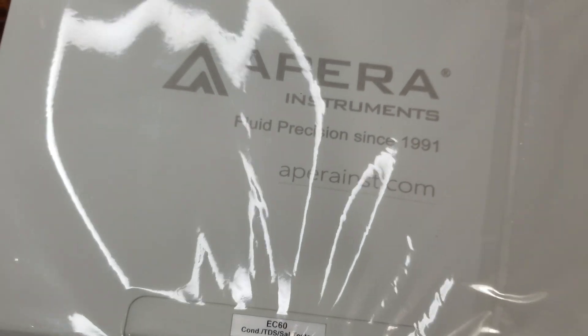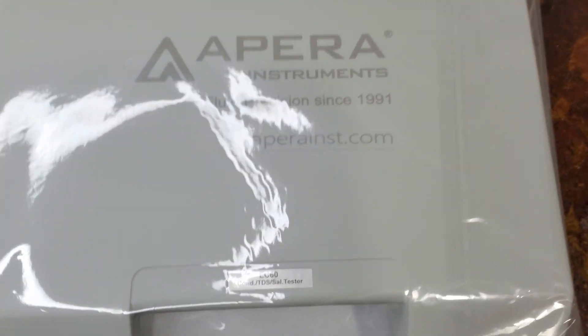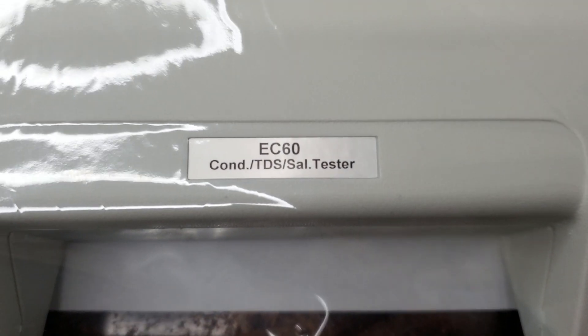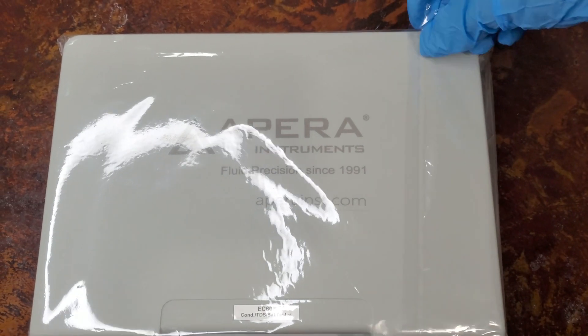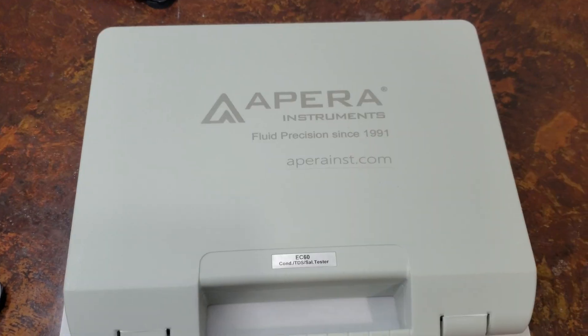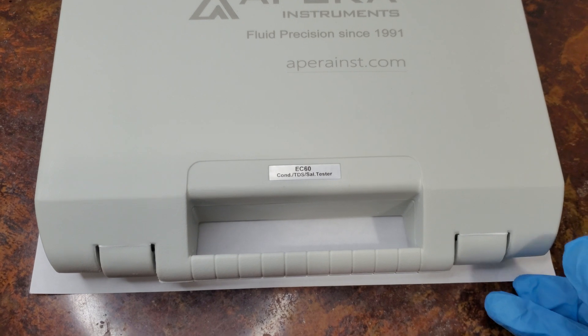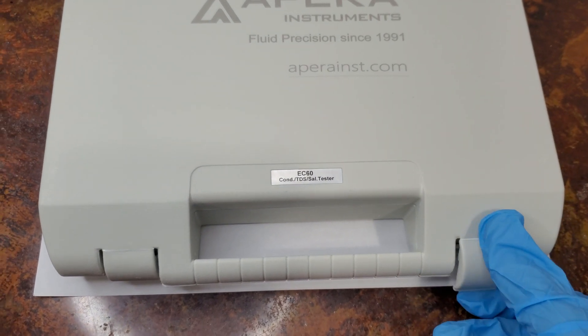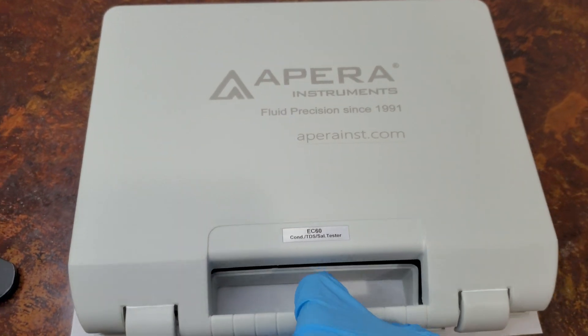This device is the APERA EC 60 meter. We use it to measure PPM and EC, also known as electric conductivity. We measure PPM and electric conductivity to make sure we know how much we are feeding our plants.